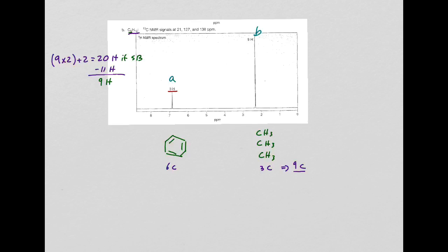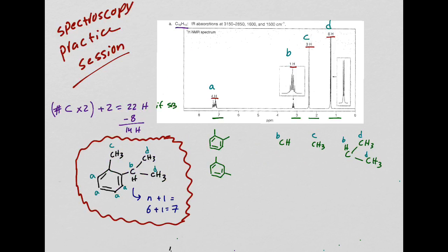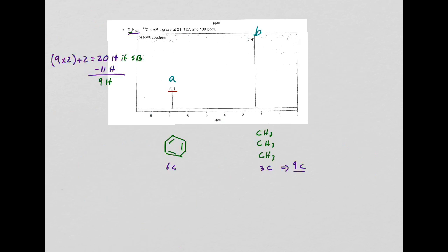Okay, so probably those carbons are directly attached to a benzene ring because then that carbon would have no hydrogen. Because again, there's no other options we have. And then this is about 2.2 ppm, so it's a little bit more downfield. So if you are directly attached to a benzene ring, you know that you're going to be more downfield. You know it from last problem, right? This CH3 was about 2.2 ppm. So every time I have a 2.2 ppm, the first thing I think about is next to a carbonyl, but I have no oxygen. And the second thing I think about, okay, is directly attached to a benzene ring.